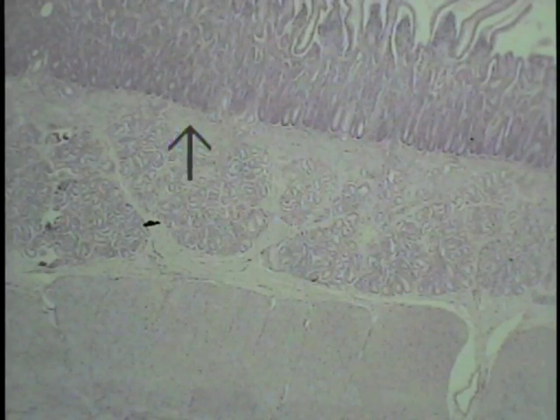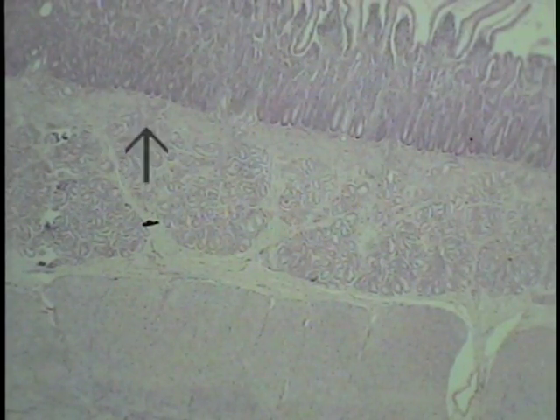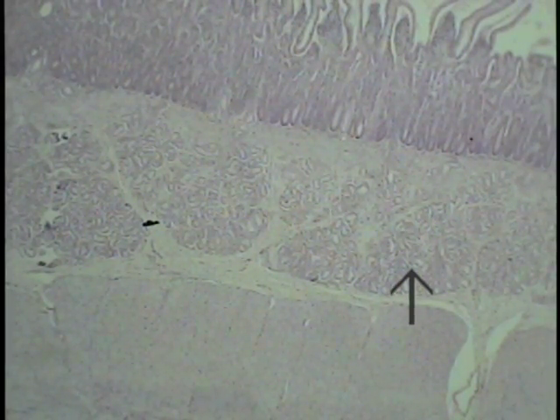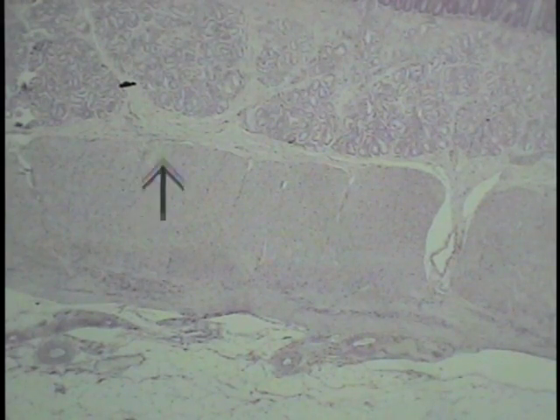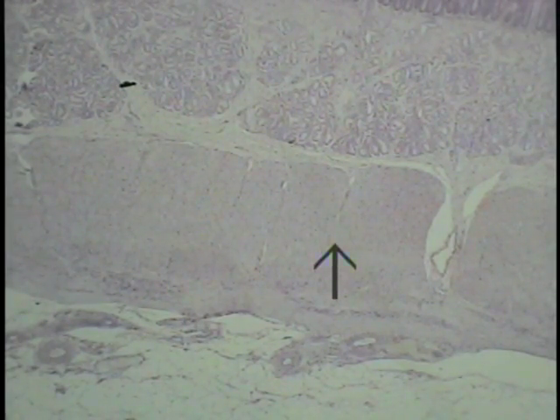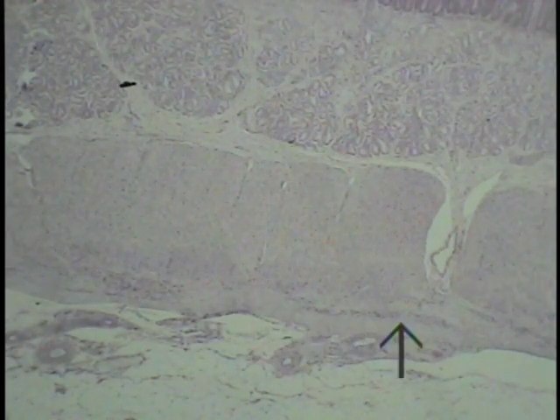The submucosa of this particular area is dominated by the presence of the duodenal glands or Brunner's glands, which are characteristic of the duodenum. So the submucosa shown here, this type of connective tissue, is characterized by the duodenal glands or Brunner's glands. Immediately to the exterior of the submucosa, one finds the muscularis externa once again, dominated by a very robust inner circular layer and an outer longitudinal layer, as indicated by the pointer. In this particular case, because it is retroperitoneal, one will have it associated with an adventitia rather than a serosa.